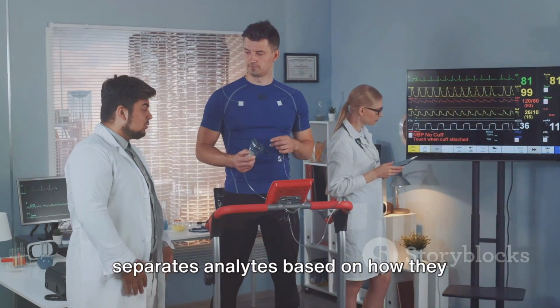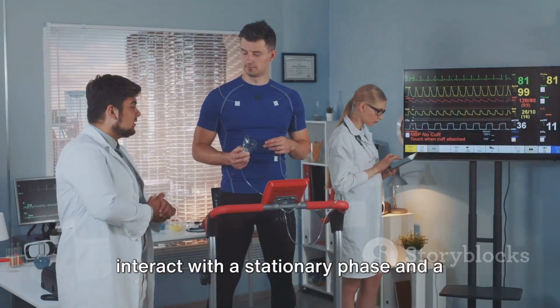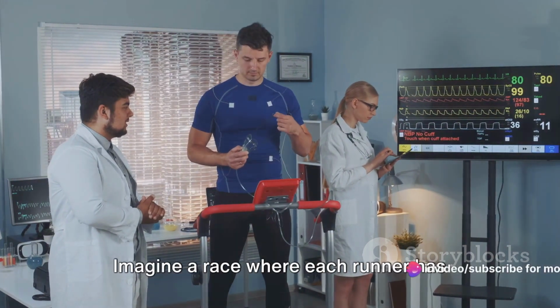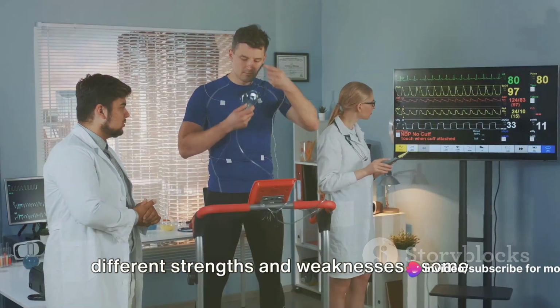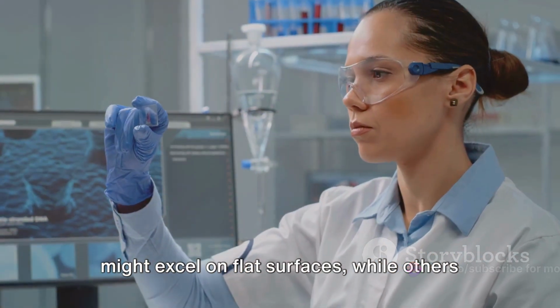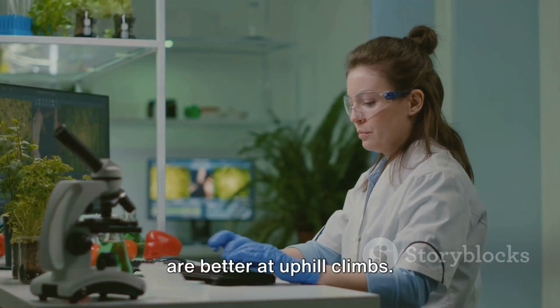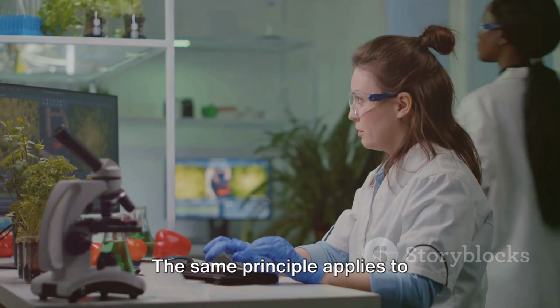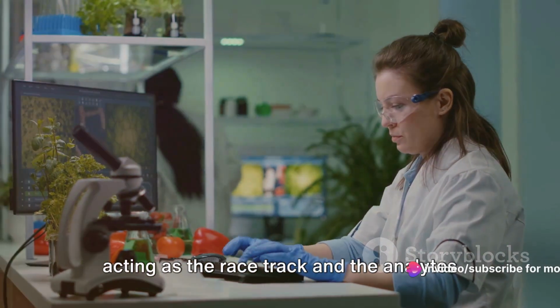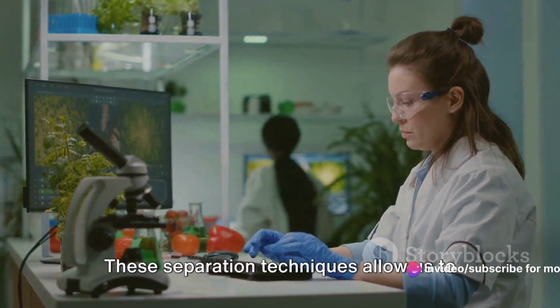Chromatography, on the other hand, separates analytes based on how they interact with a stationary phase and a mobile phase. Imagine a race where each runner has different strengths and weaknesses. Some might excel on flat surfaces, while others are better at uphill climbs. The same principle applies to chromatography, with the stationary phase acting as the racetrack and the analytes as the runners.